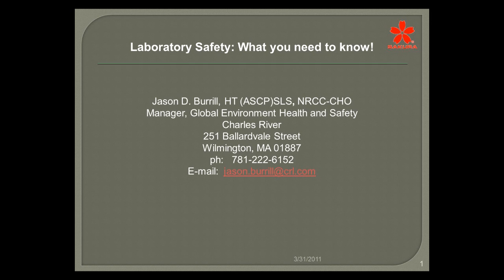Again, these regulations are pretty much all geared towards OSHA, which is the Occupational Safety and Health Administration, and falls under the Department of Labor. What I do is break them down into plain English rather than give you a lot of legalese that you won't be able to understand. And again, there will be some practical safety information reviewed during this presentation.